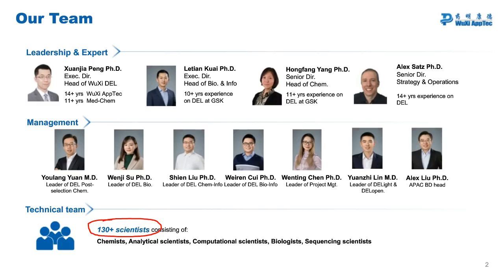How do you determine between a weak binding and a non-hit? That's tough. So I'm not exactly sure how we should define a non-hit. I would just say that as the enrichment level increases, the chances that when you resynthesize that compound and you assay it, the chances that it will be active goes up. If it's a really weak binder, whether it's a real binder or not, it still won't show up as active in the assay. So in that case, it doesn't really matter.